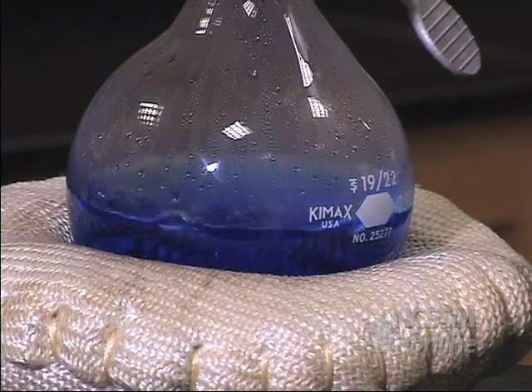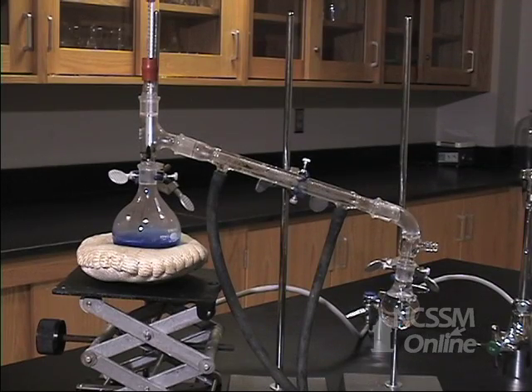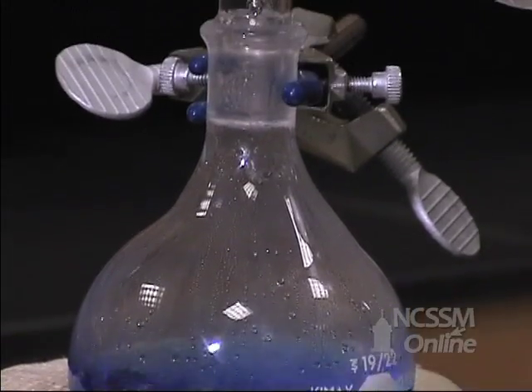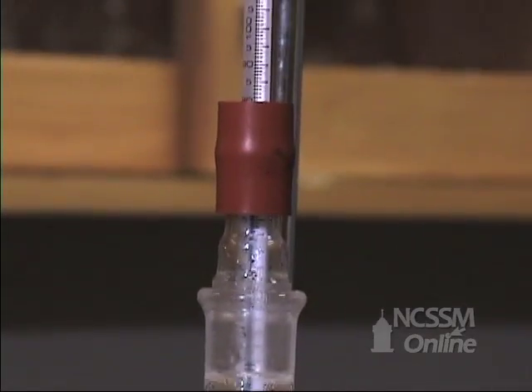As we heat the solution in the distilling flask with an electric heating mantle, the methanol reaches its boiling point and converts to a vapor. The vapor from the methanol travels up to the still head and condenses on the thermometer.